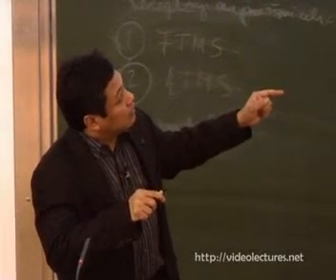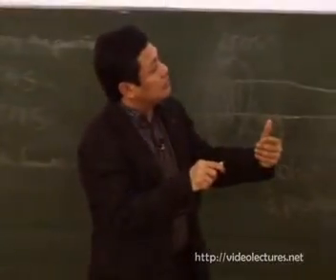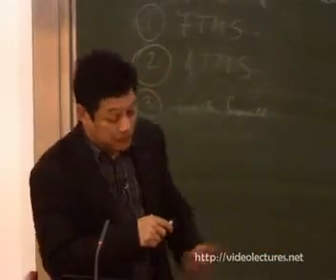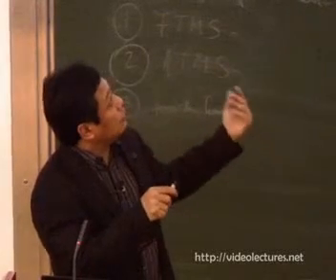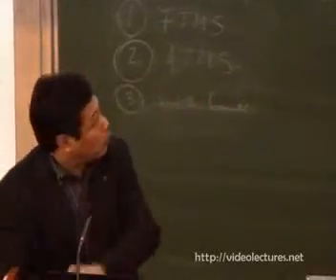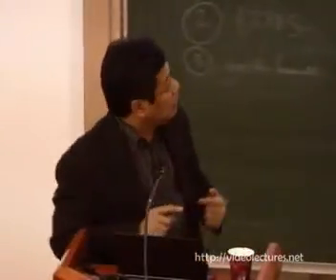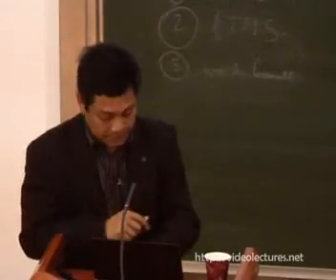By removing neighboring molecules, the center molecule is exposed to the surface state electrons and starts to have contact. On this substrate, we know that the Kondo effect is contributed by substrate electrons, both surface plus bulk. Here we simply remove the surface electrons, so it has only the bulk, in the case where 7 molecules are surrounded. So now we know that this effect is due to the quenching of the Shockley surface states by putting the molecules around, and we can change the Kondo temperature because we are manipulating the number of substrate electrons that interact with the cobalt atoms.